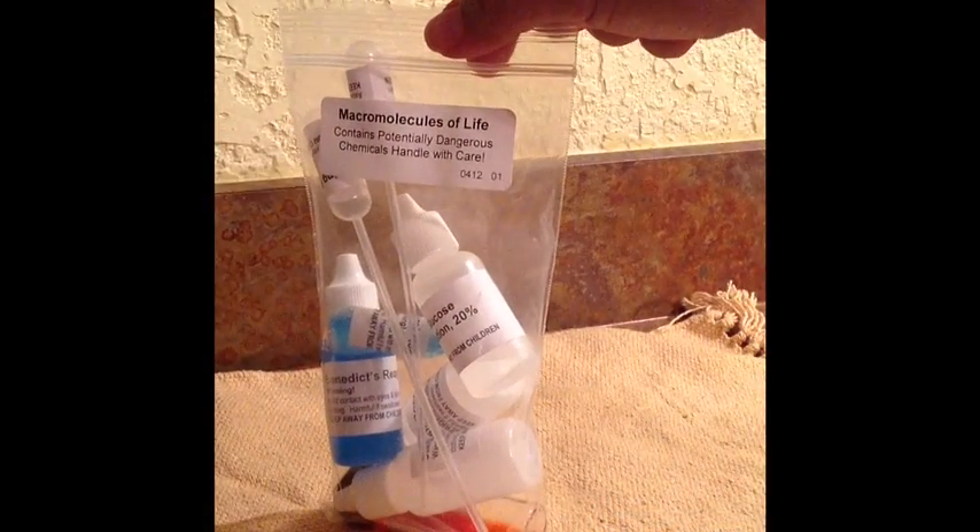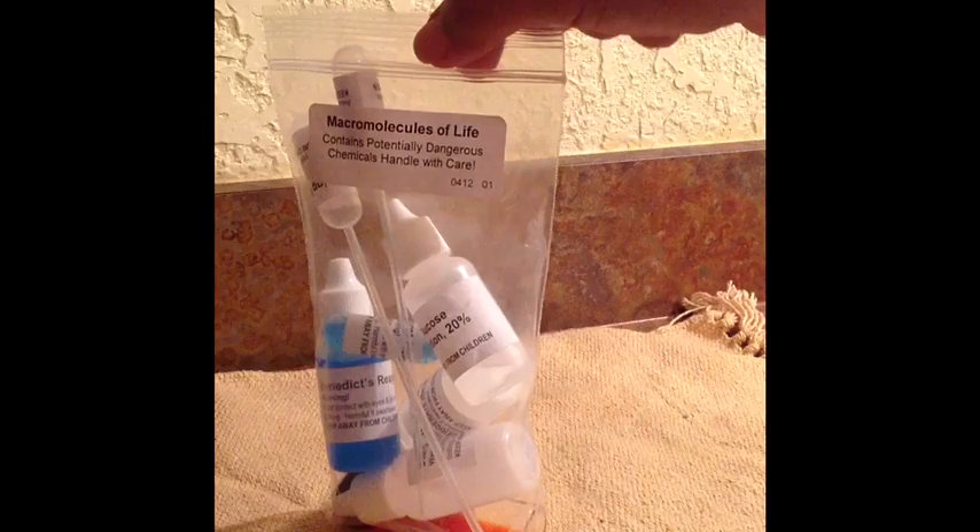All of the chemical reagents that you need are in a bag marked Macromolecules of Life. This used to be packaged into two separate plastic bags, but in the new kit, which you have, they're all in a single container.